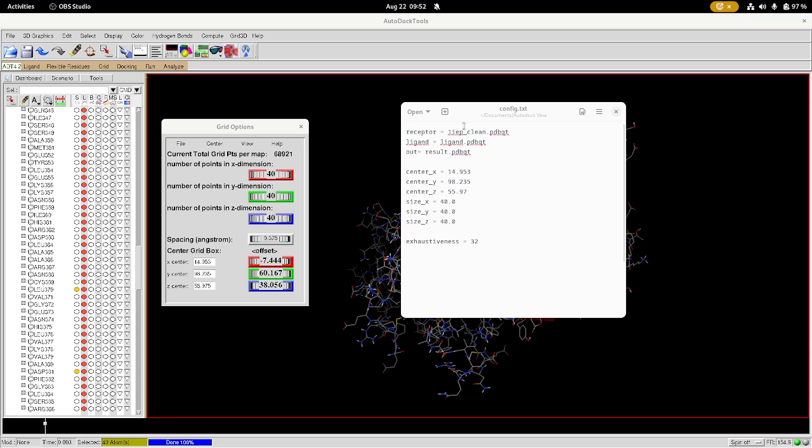So you can see here we've got the receptor specified. That's our structure that we made into a PDBQT. We've got our ligand as ligand.pdbqt and out is what the results are going to be called. So the results are going to be called result.pdbqt.